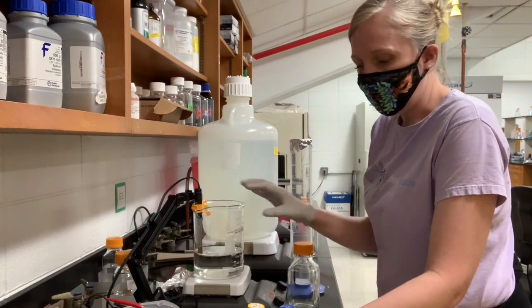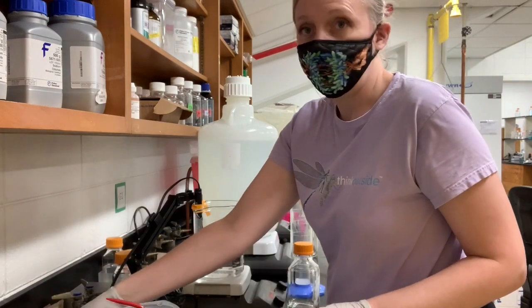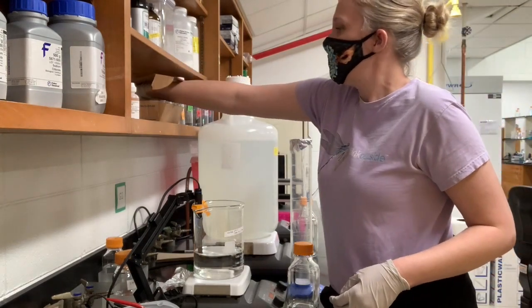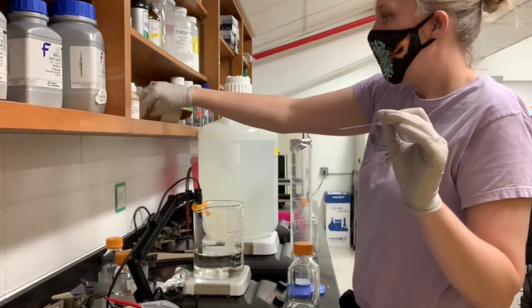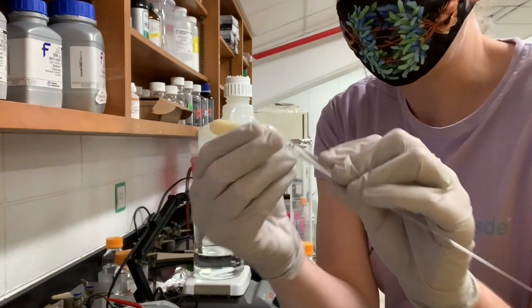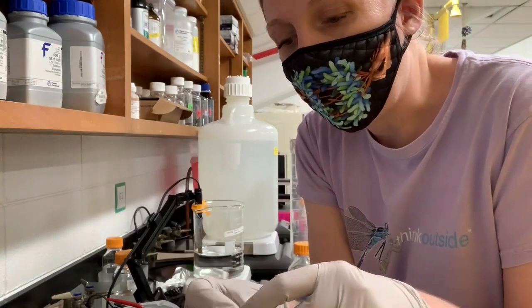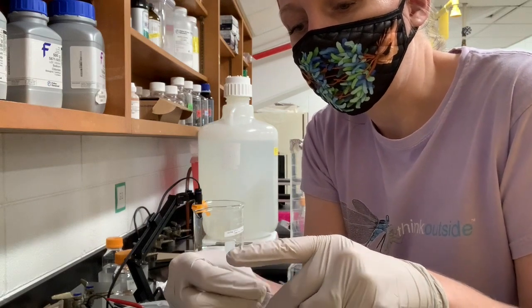And so we'll pH the solution. I will say I've already capped all of my pH solutions, and I'm going to put them back so that they don't spill. Okay, so over this bench, there are some glass Pasteur pipettes that look like this. And there are some little bulbs that will fit onto the end of the transfer pipette. It's a little bit easier to use glass pipettes for strong acids and strong bases, because those can corrode plastic pretty easily.